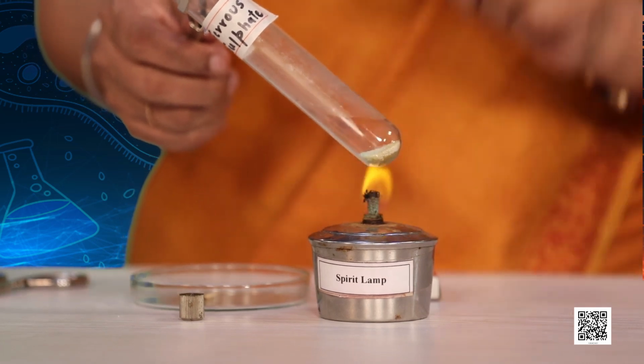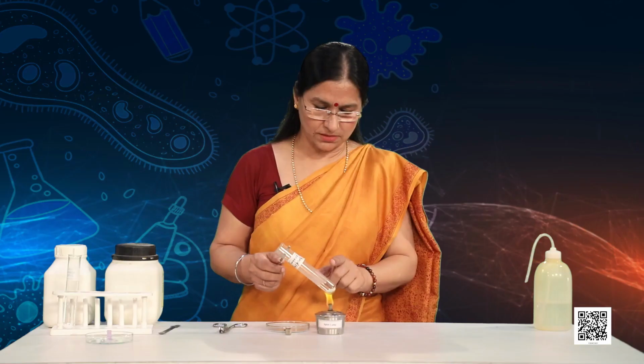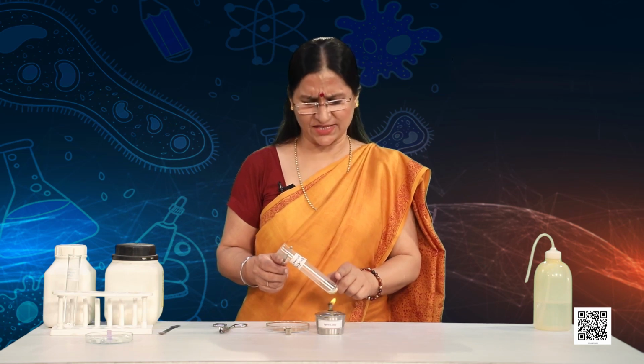And yes, the fumes coming out of this may be very poisonous, so you have to be very careful. Never inhale it directly. Can you note the change in the color of the ferrous sulfate crystals? I think the green color has changed. And yes, the crystals are now turning brown.